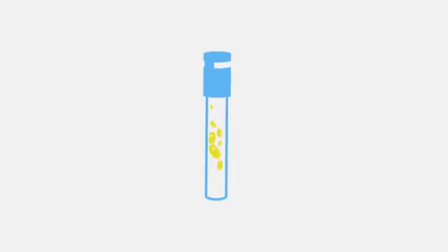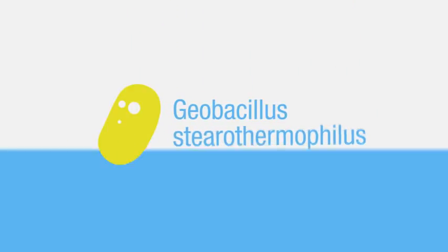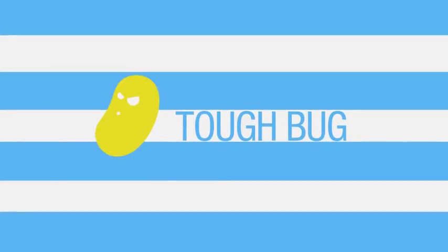BIs contain actual living organisms. In the case of steam, hydrogen peroxide gas plasma, and ozone sterilization, Geobacillus stearothermophilus is the name of that organism and is one tough bug. This thermophile is widely distributed in soil, hot springs, and ocean sediment, so it is no stranger to the heat.